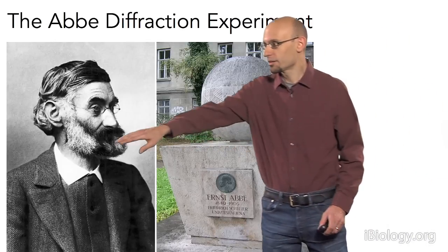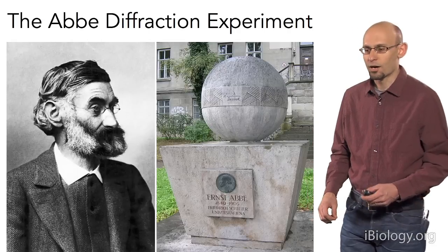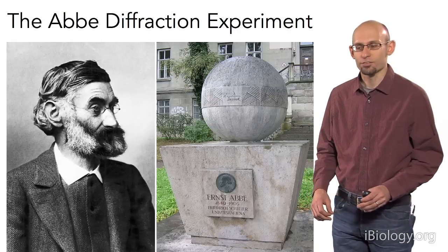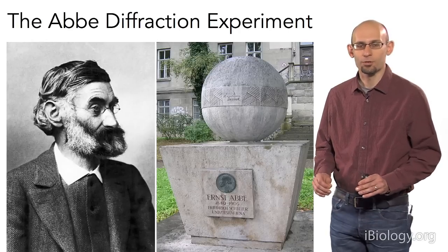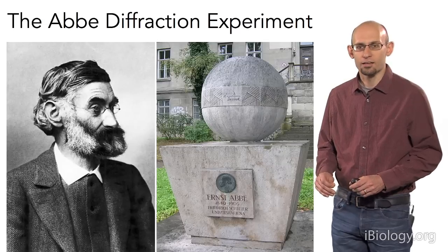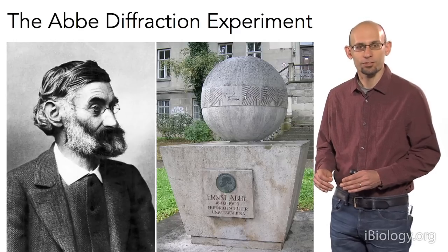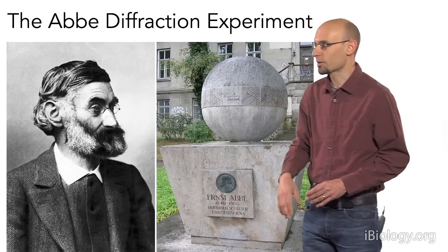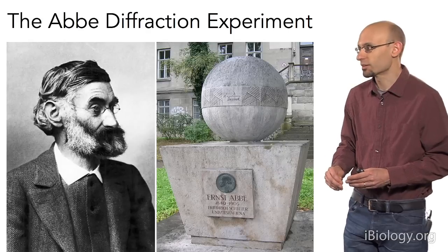So this man here is Ernst Abbe, who is one of the founders of modern microscopy in a sense. He was active in the late 1800s working with Carl Zeiss and others in really formalizing the performance of the optical microscope and learning how to build diffraction-limited objective lenses, and in fact was one of the people who identified what was actually limiting resolution in the light microscope. And his diffraction experiment, the Abbe diffraction experiment here, is how he formalized that definition of resolution.